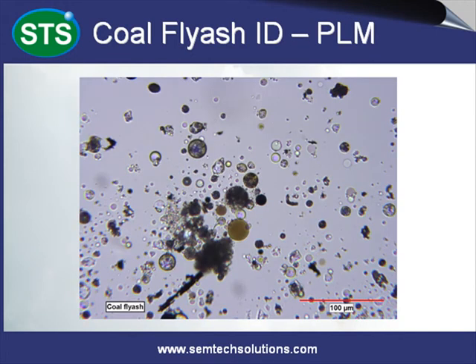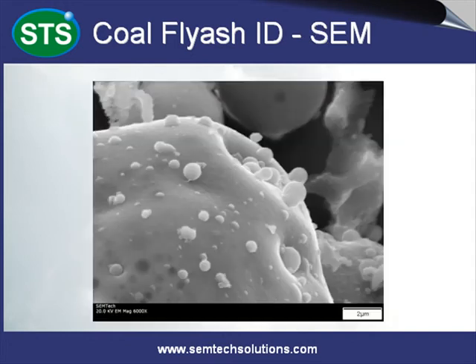PLM observation of coal fly ash shows clear to transparent glassy spheres, sometimes with opaque inclusions. No melting occurs in the immersion oil for coal fly ash.